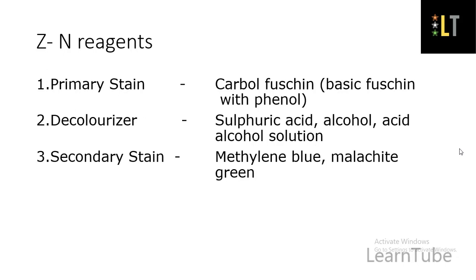Decolorizer, it can be either only acid or only alcohol or an acid alcohol solution. So sulfuric acid can be used as only acid, alcohol, ethanol can be used, and acid alcohol solution in combination can also be used as a decolorizer. In secondary stain, we usually go for methylene blue or malachite green.